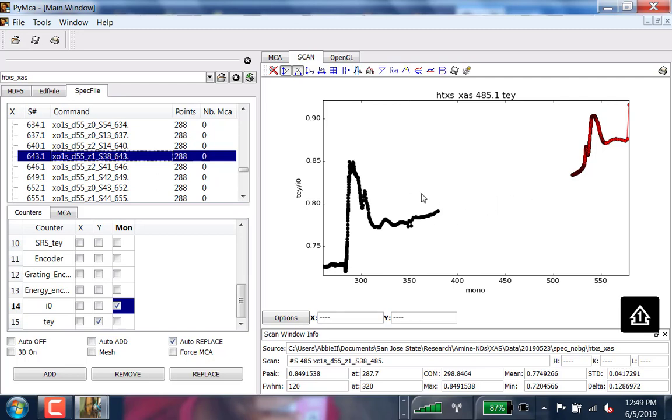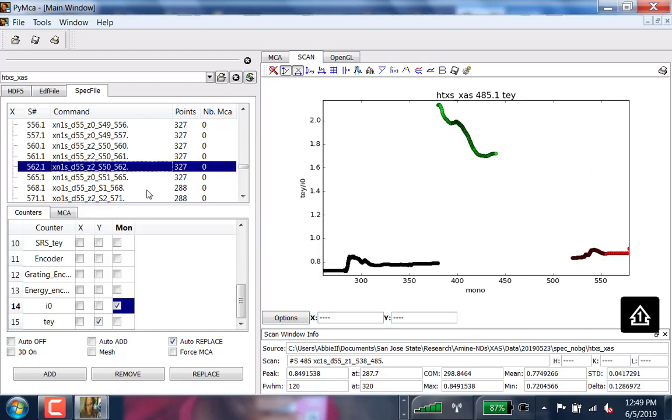I don't think we did it as a control for S38, I don't believe. Maybe we did. That's what it looks like. Oh, interesting. So, we've got that in there as well. It's in there somewhere. Yeah, I don't see it. I selected it, so I hope... I'm not seeing it, but that's okay. I'll just put in S50 as a holder in there. Nitrogen we didn't do. No.